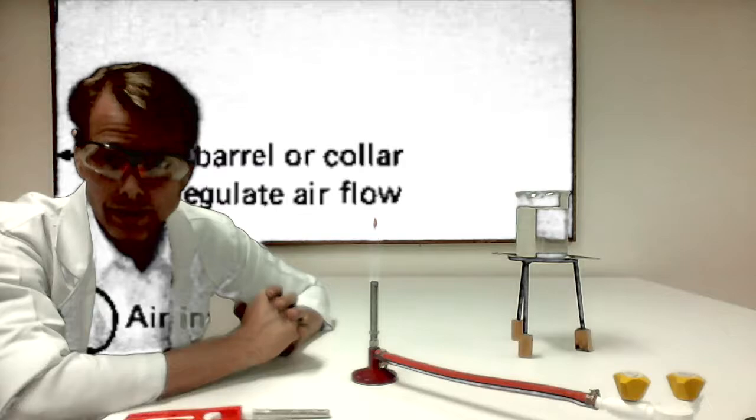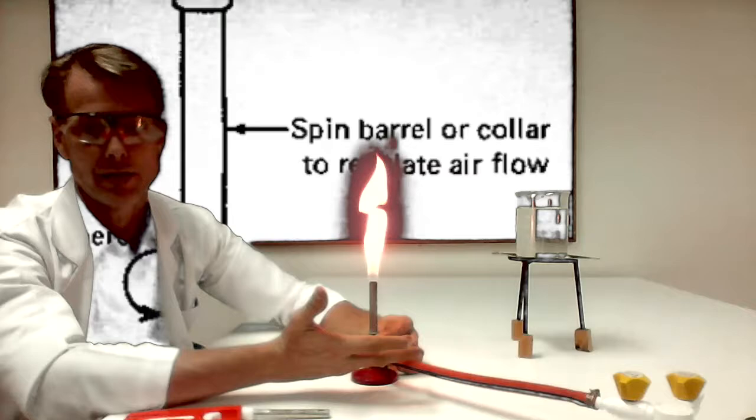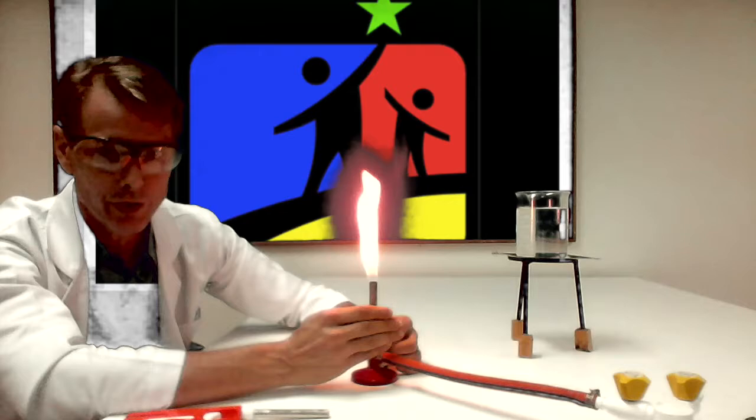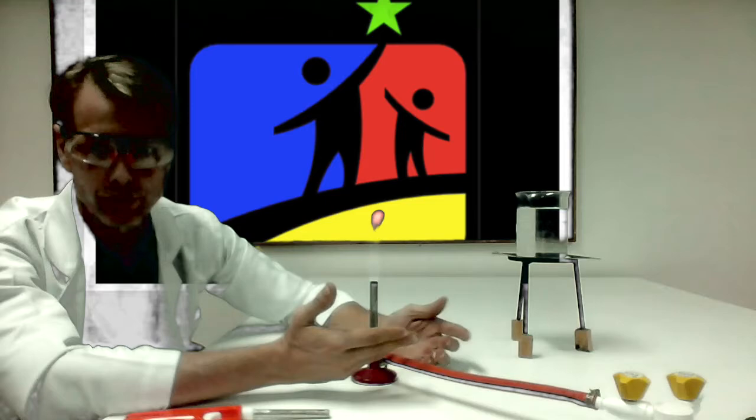If the power went out, then a better flame would be the luminous flame. Makes a lot of light, but not as much heat. A lot of light, but not as much heat. For lab purposes, we primarily use the non-luminous flame. Not the luminous flame. Not this one. But the non-luminous flame. The non-bright flame.